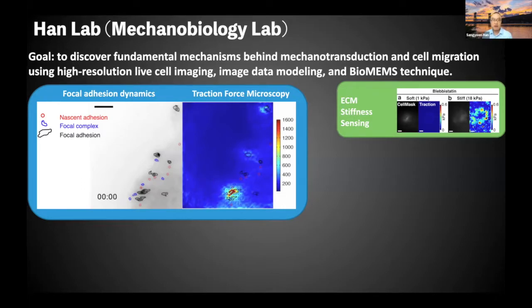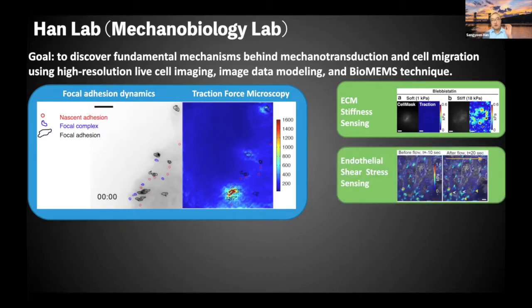We apply traction force microscopy and image analysis to show the force transmission between the adhesion, cytoskeleton and ECM, and the mechanism behind that. That's Nikhil's project.